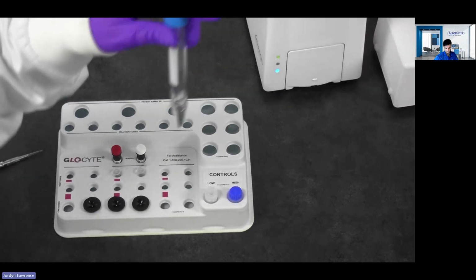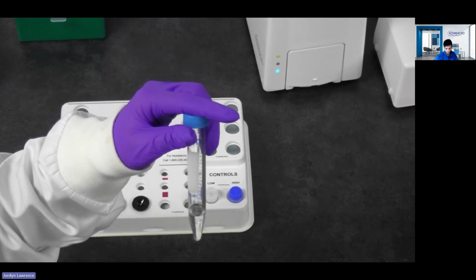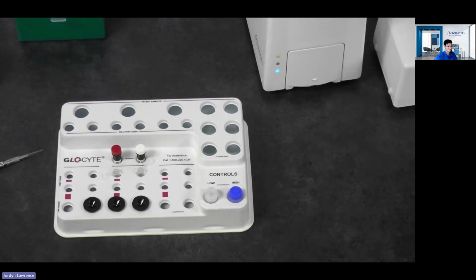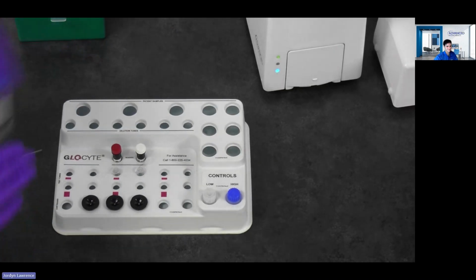And right here, I have my sample. Don't worry, this is just a sample from the lab. I did not stick Nick with a 4-inch needle to perform this demo today. I promise it is all for just a demonstration. But let's jump into it.